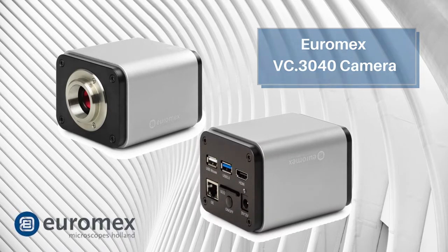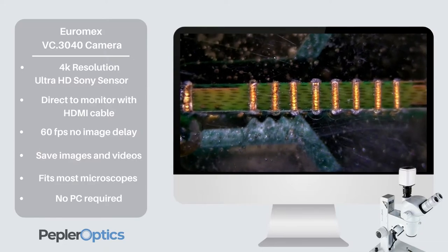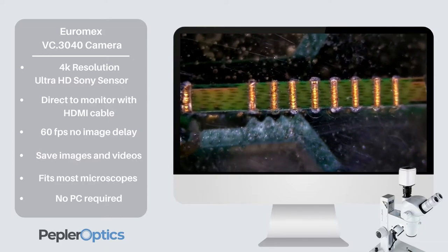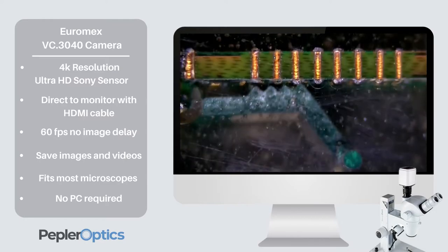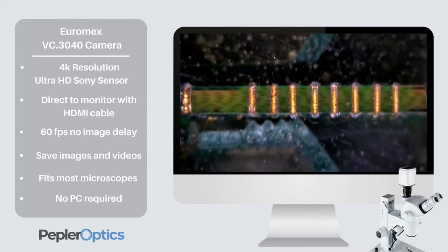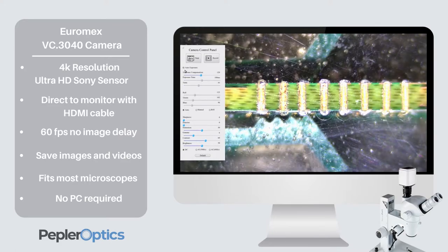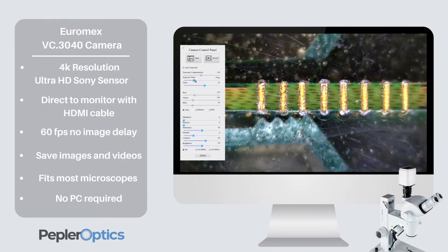Welcome to our short video on the VC3040 microscope camera with 4K Ultra HD resolution. Watch in real time how images move without any delay and see the amazing image quality. Connect it directly to a monitor — no computer is required — yet you can still save images and videos.